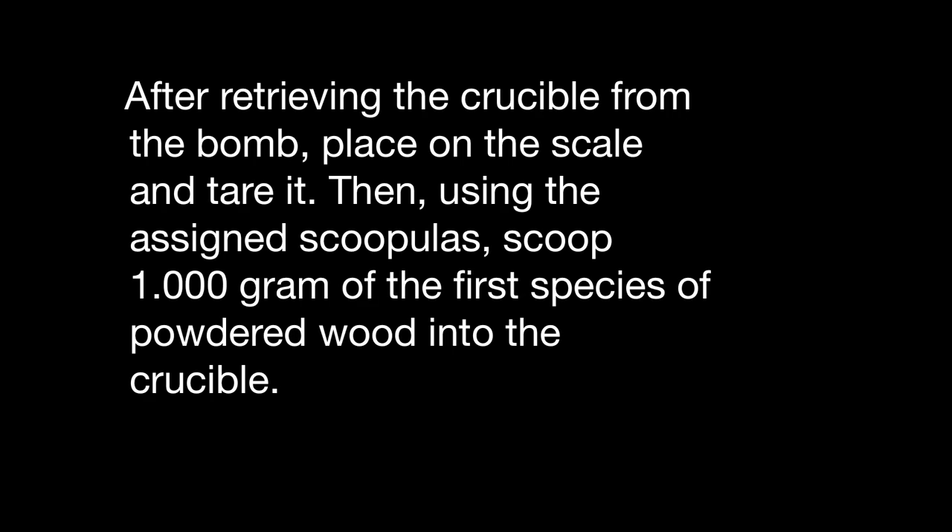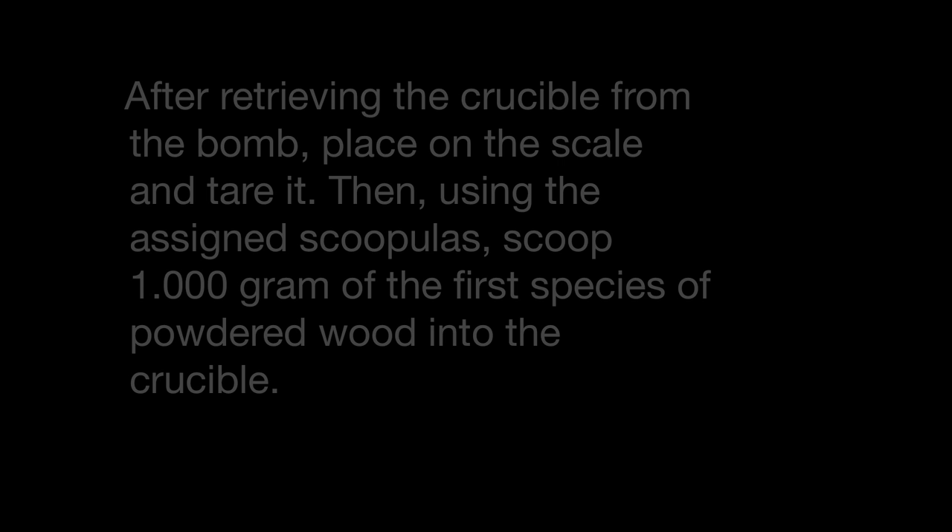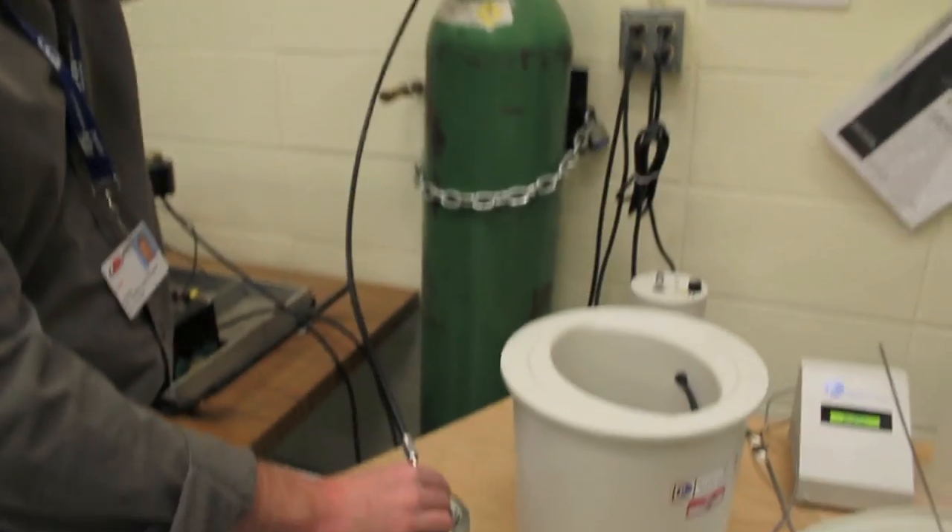After retrieving the crucible from the bomb, place it on the scale and tare it. Then using the science spatulas, scoop one gram of the first species of powdered wood into the crucible.